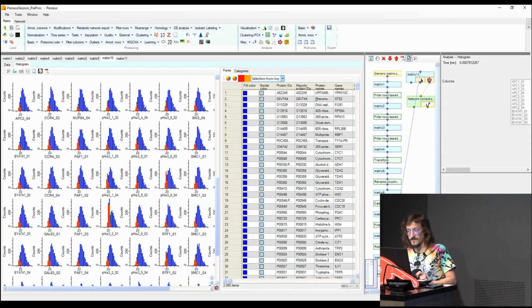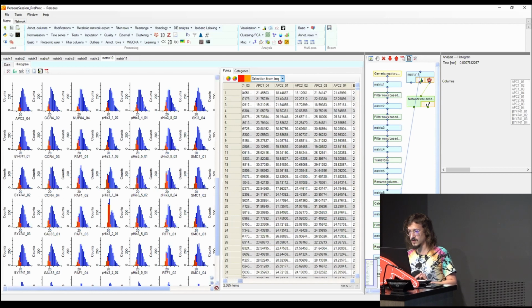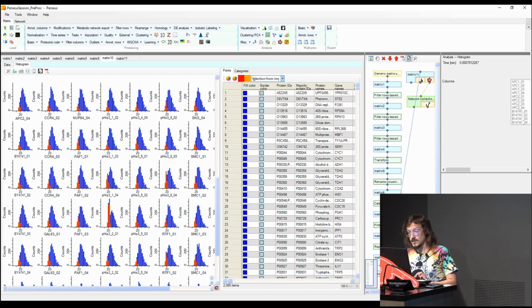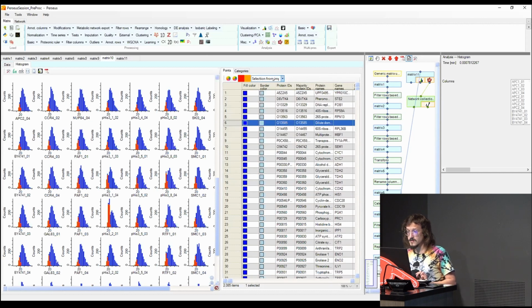So here on the top, this is the matrix represented again, your original matrix, in this case matrix number 10. Here you have the information as usual, for every condition the LFQ value, and all the annotations. You can select them here and change their colors with these buttons. But then if you want, you can decide to highlight some of them depending on selection from table.